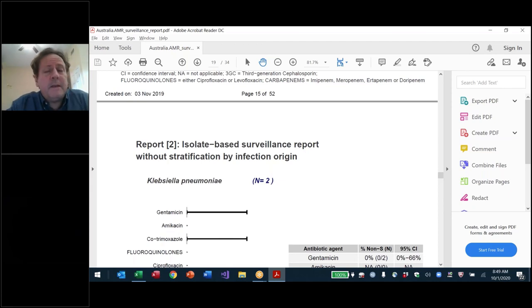Let's see. It depends on a number of factors. In part, your time. So in terms of the annual report for epidemiology, that you want to publish data, you want to submit data to GLASS, you want to start with the best facilities. Also, keep in mind that the best facilities themselves have trouble, either in terms of data completeness, like age and gender, antibiotic test practices.